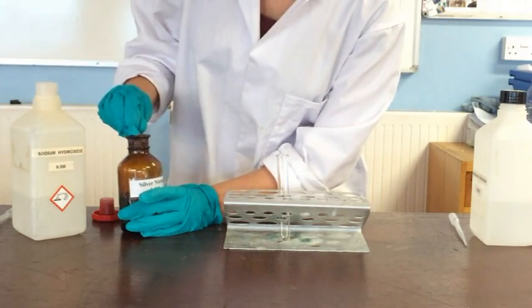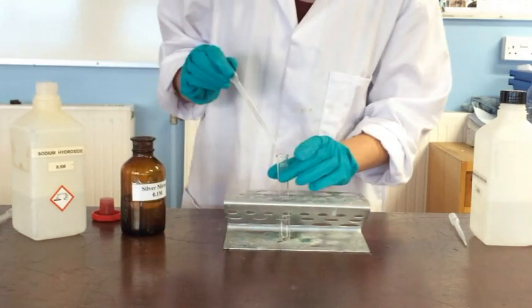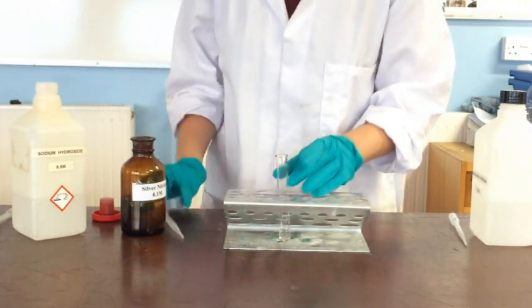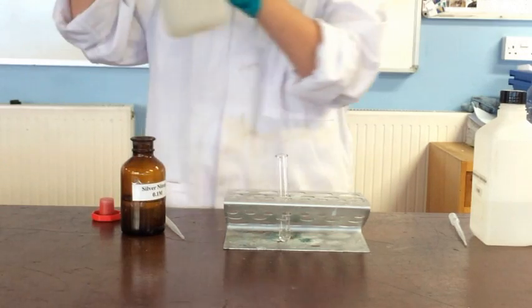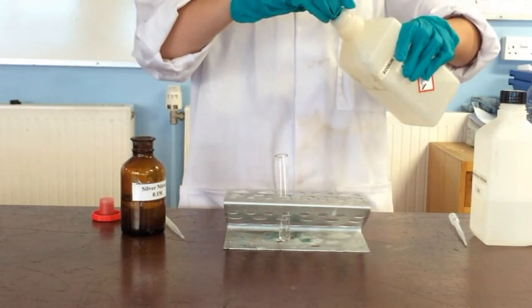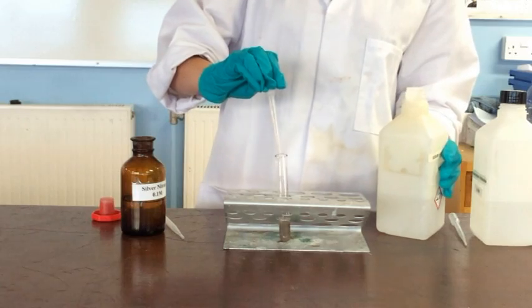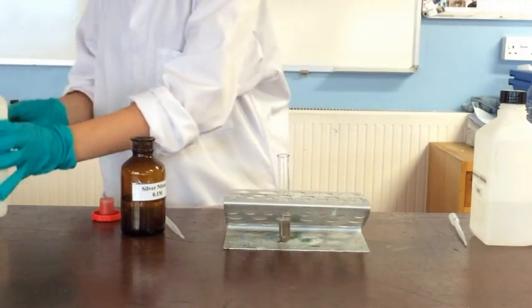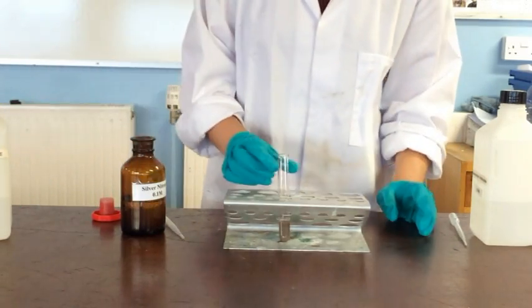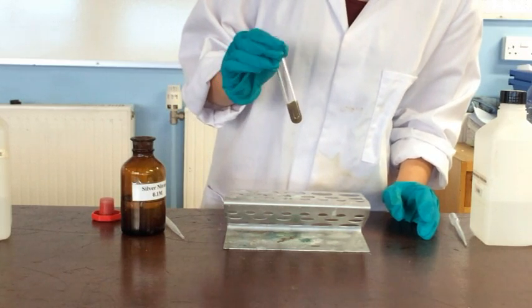First of all we're going to mix some silver nitrate with some sodium hydroxide. And that should have formed a brown precipitate which is silver oxide, there you go, you can see that there.